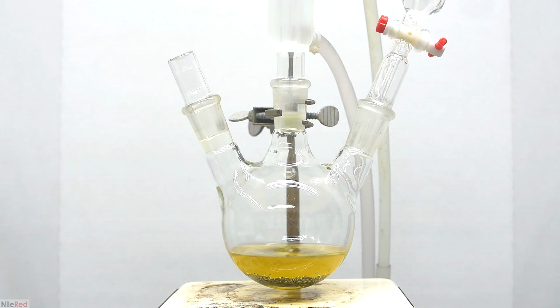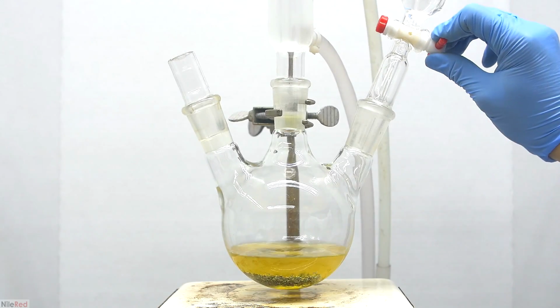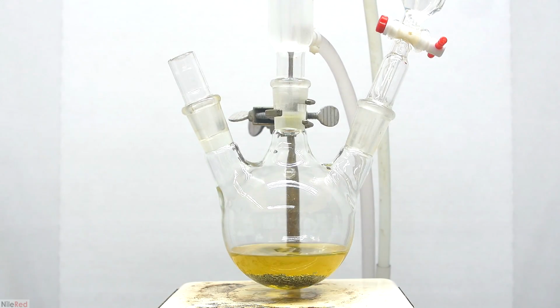It's really not uncommon for this to happen, and if it does, there's two main ways to get things going. The first is the lazy man method, and you just throw in a bunch more iodine, and the second is to grind the magnesium shavings using a glass stir rod. These methods are pretty different, but they do pretty much the same thing.